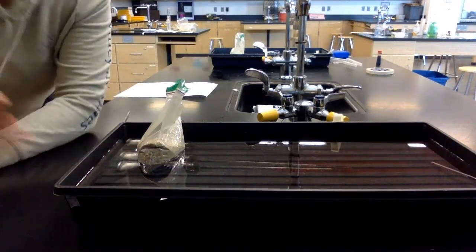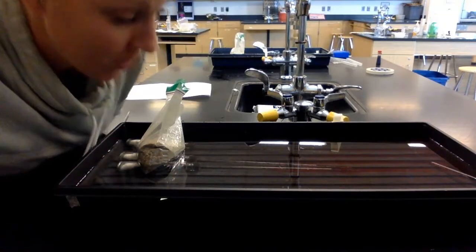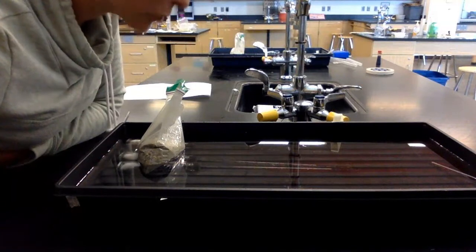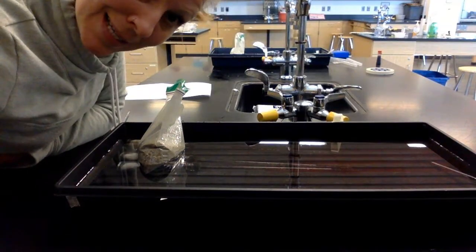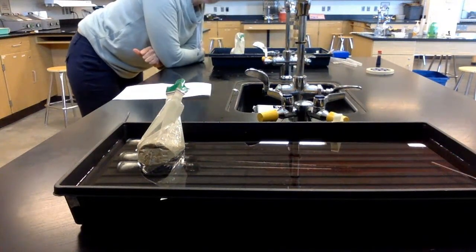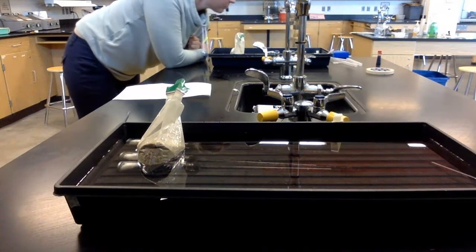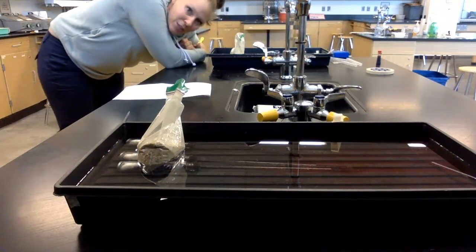At minute 25: respirometer one is 0.58. Respirometer two is 0.84. Respirometer three is 0.90. Respirometer four is 0.77. Respirometer five is 0.84. Respirometer six is 0.92.